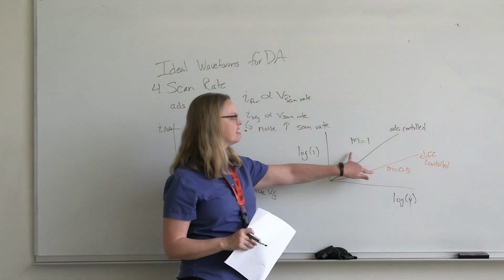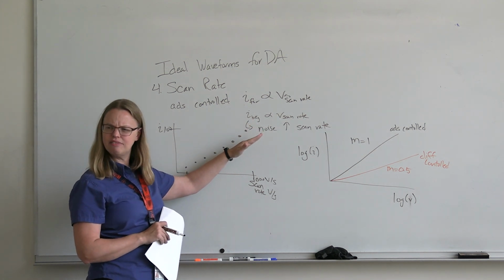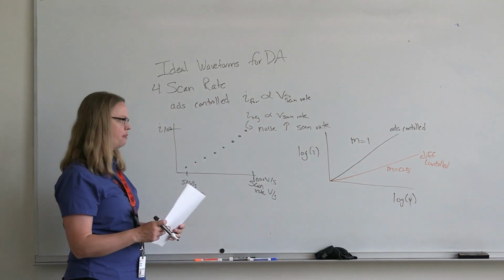But this is a little bit better than just asking, does that really fit a line? Is this 0.97 good enough? How about 0.96? Yeah, whatever, R squared. This will give you a more practical indication of whether or not you're doing this experiment correctly.